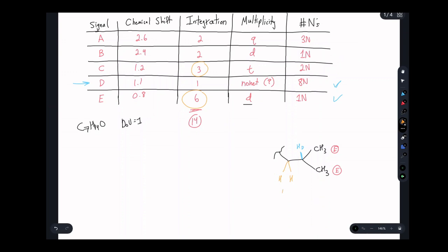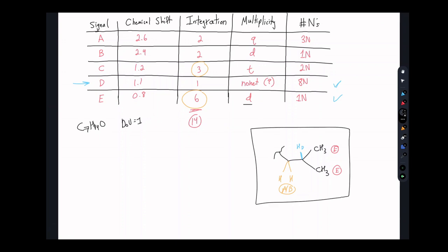We know that it can't be C at this point, but we can say maybe it's A or B. We're not really sure, and at this point, that's where we want to stop. We don't want to make an assumption that it's A and then keep going, or make an assumption that it's B. That could lead us astray. We're still using this doorway method at this point to avoid making assumptions. So with that in mind, we have our first puzzle piece, our first fragment, if you will.